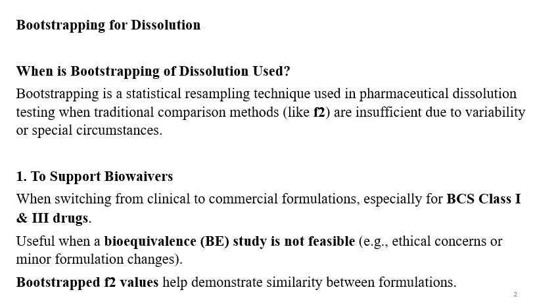Bootstrapping is a statistical resampling technique used in the pharmaceutical dissolution testing when the traditional comparison methods like F2 calculation are insufficient because of the variability of the dissolution results or because of some special circumstances.